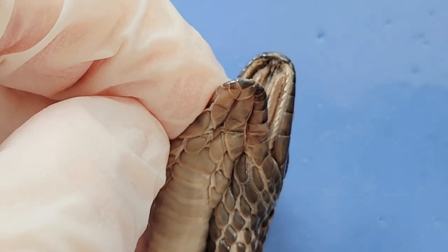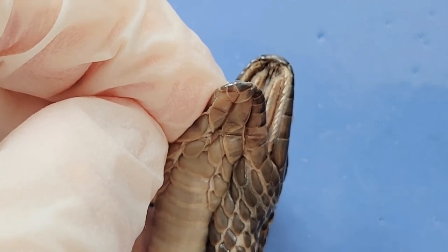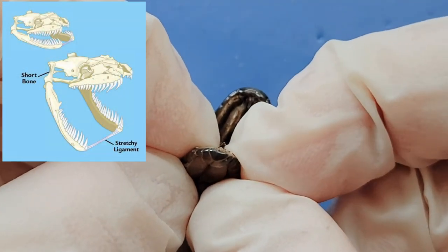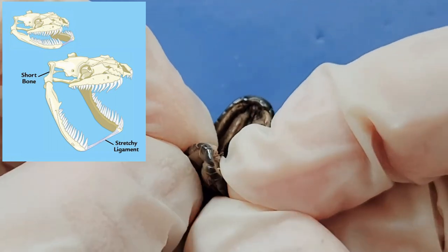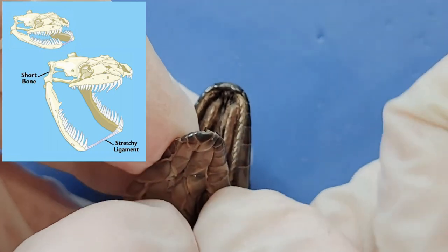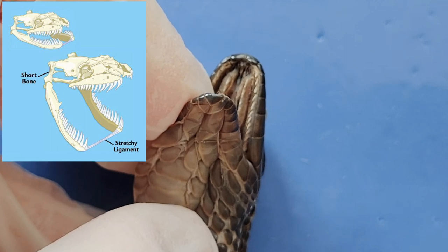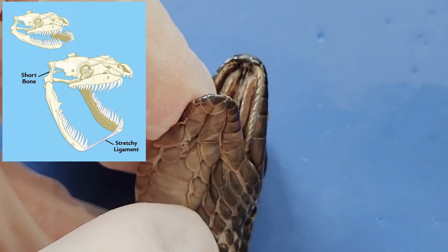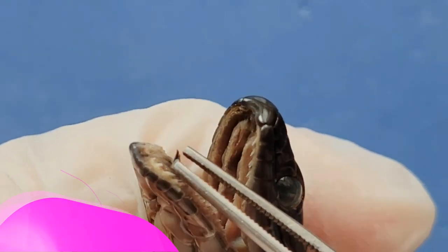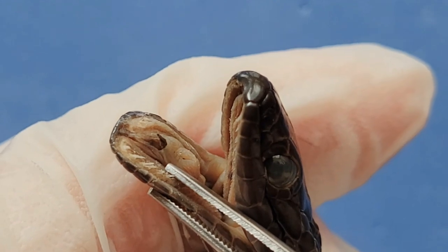Now let's look at the snake's jaws. What's really interesting about the lower jaw is that it's actually made of two separate bones connected by a stretchy ligament, so I can move each half of the jaw separately. If you feel your own jaw, you'll see that it's one solid piece of bone. In contrast, the snake's uniquely separated jaw allows it to open its mouth much wider to swallow prey that is many times larger than its head. The tongue of the snake is visible right here — it's actually much longer than it looks, since much of the tongue is coiled up inside the snake's mouth when not in use.